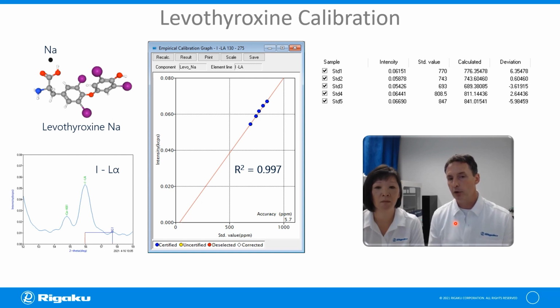If we were to do the K line, we could do larger amounts of sample and we can get even more signal using that K line. It just depends on what purpose. So if you're interested in learning more about that, contact Tun and I and we can work out some time to talk to you directly.